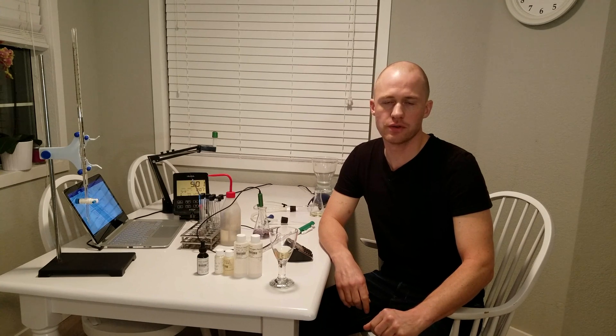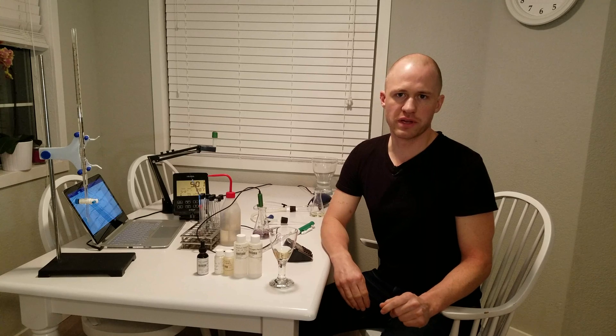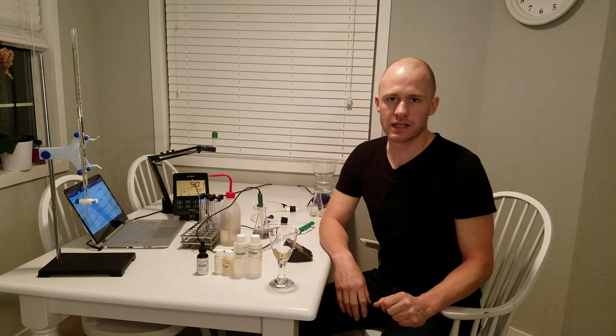Hello brewers and lab nerds. Today I'm going to show you how to do an SO2 test. You're going to check how much free SO2 is in a wine sample, mead sample, or even a beer sample. It's a little bit backwards because I haven't made the video to explain why you're using SO2, how much you can use and all that, but we'll get to that later.